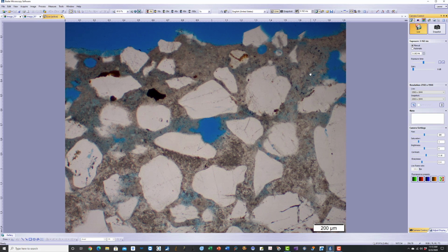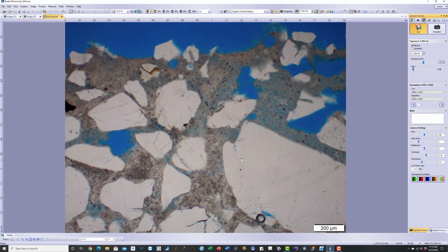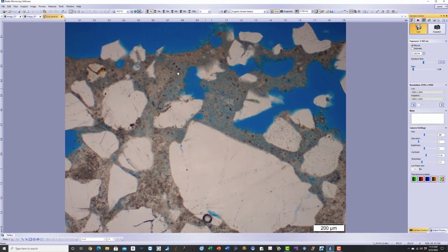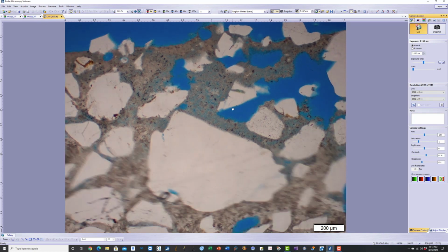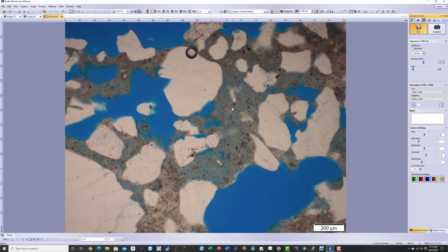This is a jointing mortar in plain polarized light. You can see well hydration of cement. There's very little residual cement particle. Also, there are patches of areas in the paste which are darker, denser, due to inadequate mixing of cement and water. You will have dark patches and porous areas, which show the mixing of cement and sand wasn't uniform to create a uniform, homogeneous porosity of paste.